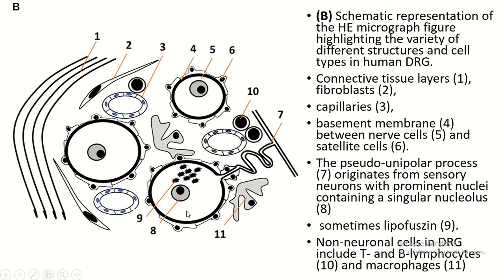This is the cell body of the sensory neuron with satellite cells. This is the pseudo-unipolar process. And this is a lipofuscin granule. These structures are present within the dorsal root ganglia.